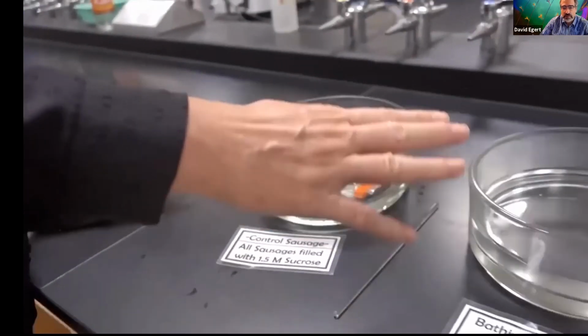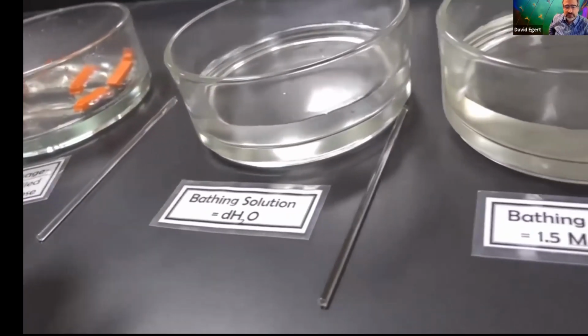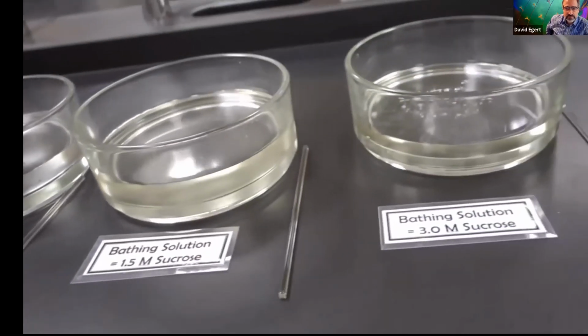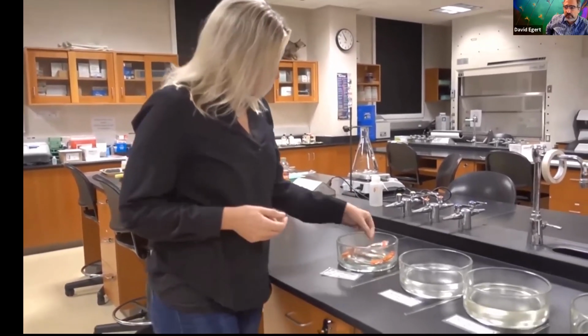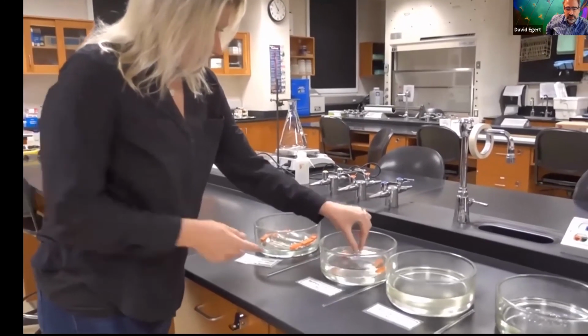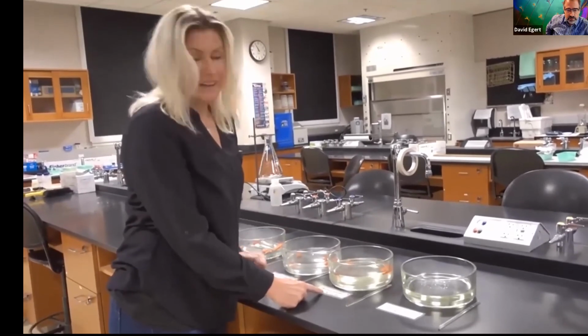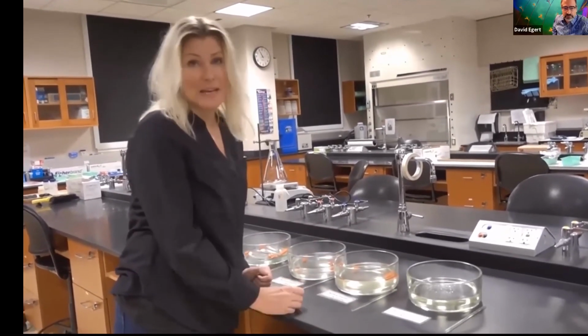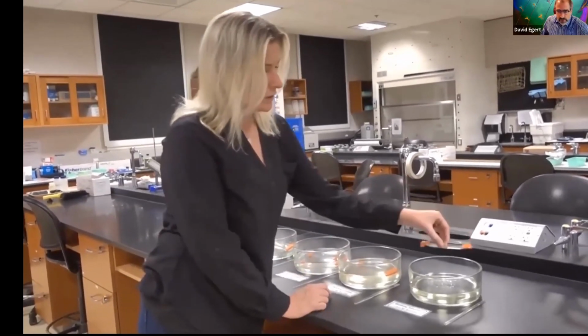Next, we're going to stick them into different solutions, and we're going to see which way the water is going to move. As you remember, in osmosis the water moves from a low solute concentration to a high solute concentration. Another catchy way to remember that is that water chases solutes. So I'm going to stick one in distilled water. I'm going to put one in 1.5 molar sucrose solution, which is the same as the inside of the sausage. Remember, all of the sausages have 1.5 molar sucrose solution.